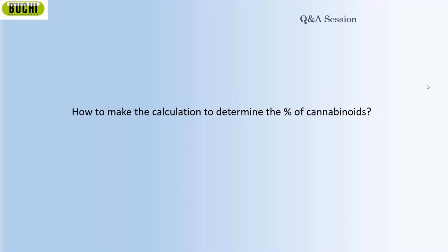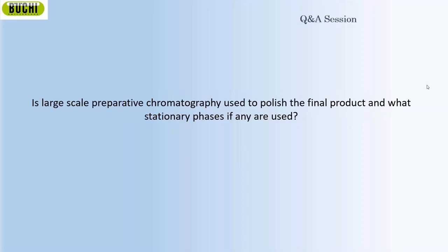Thank you very much. And another question we have is, is large-scale preparative chromatography used to polish the final product, and what stationary phases, if any, are used? Okay, that's great. So this is also what we mentioned. In chromatography, in flash systems, you can have normal phase and reverse phase. We determine whether we should go for normal or reverse phase depending on the polarity of our product.